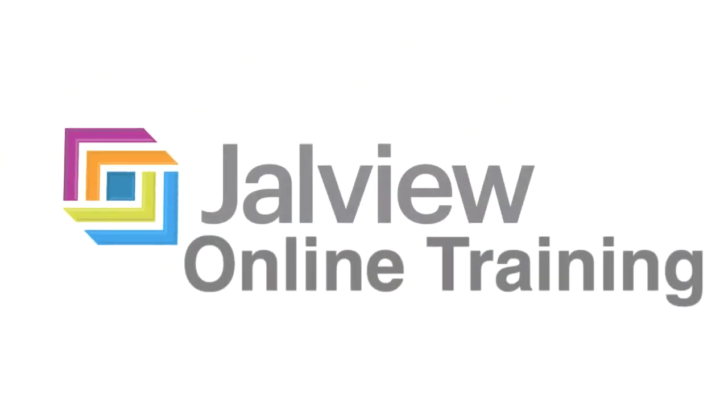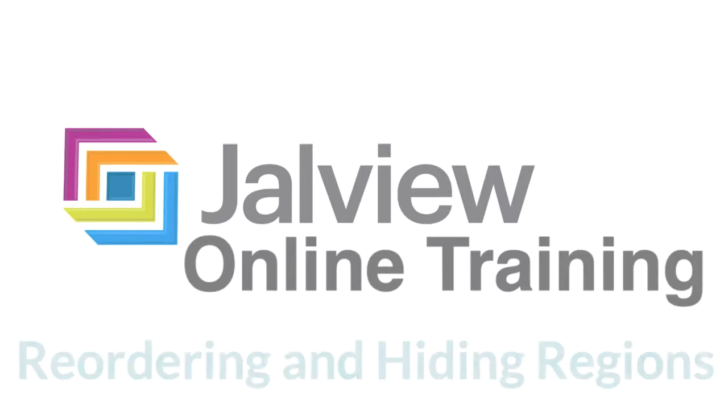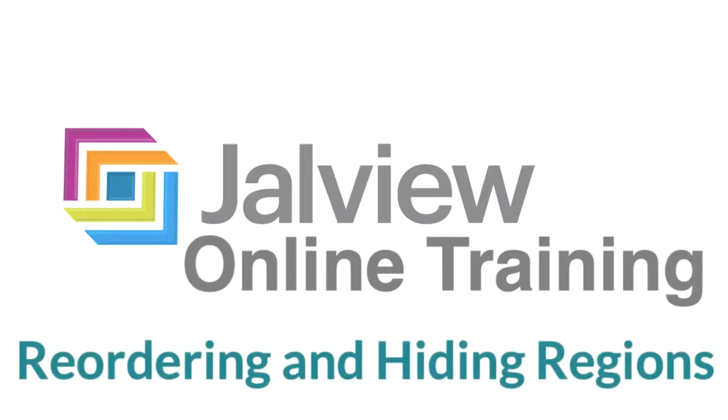In this Jalview online training video, I will be demonstrating how to reorder and hide regions in a sequence alignment.